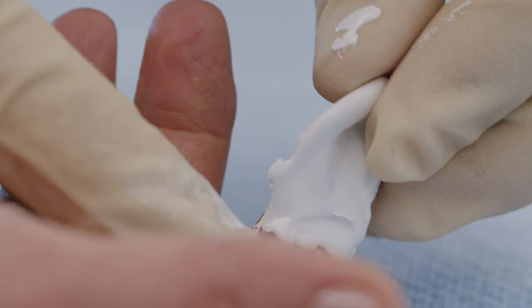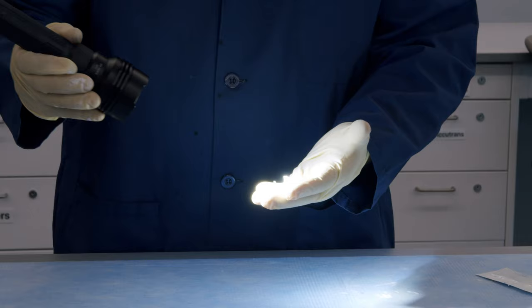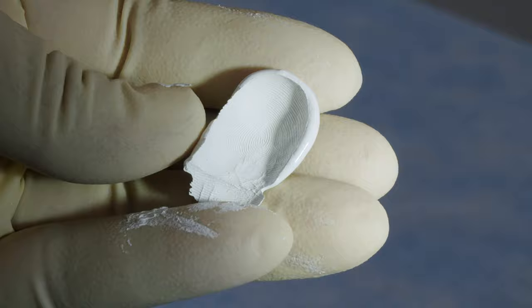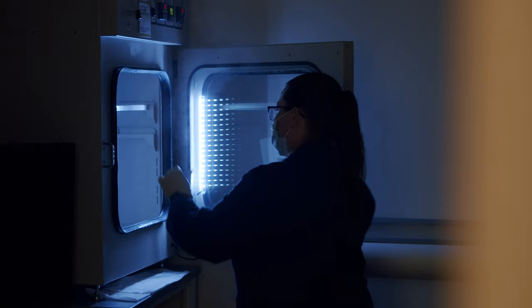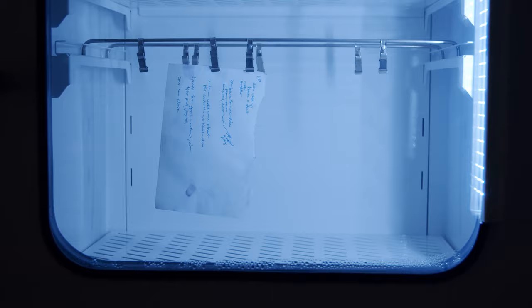On our fingers, we have three basic patterns. We have a loop, a whorl, and an arch. So the arrangement of those features and their location is unique to every person. So when we're looking at fingerprints, we're looking at that detail. You need some type of lighting, special lighting, or you need some type of powder to make it visible, or some type of chemical process to make it visible to the eye. And that is what we call a latent print.